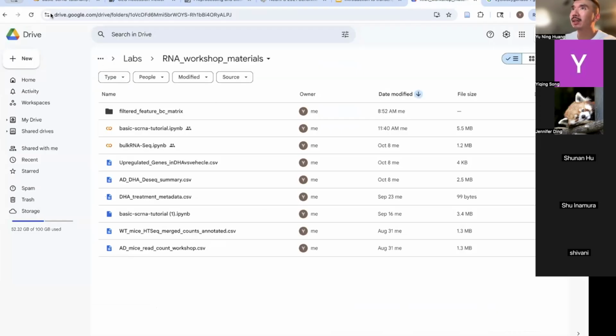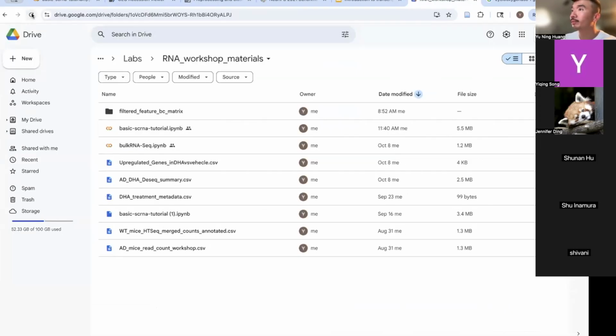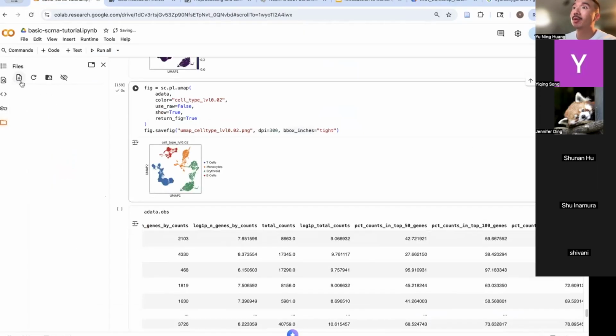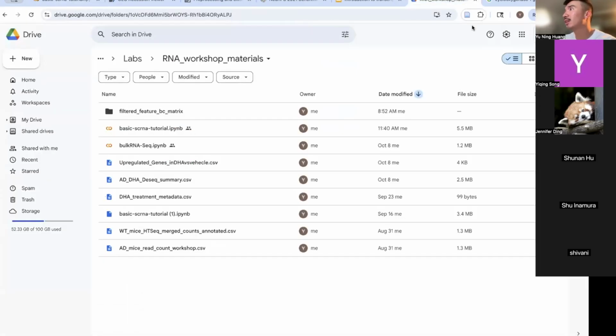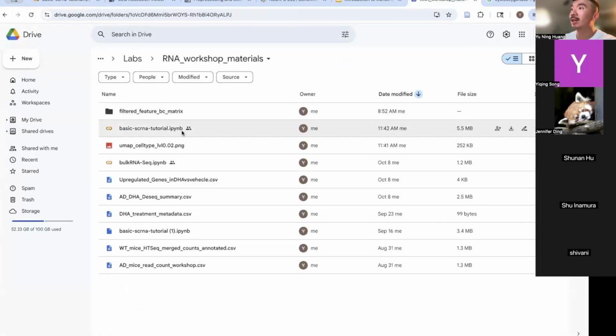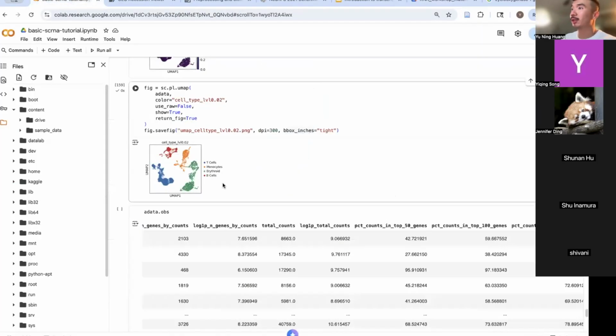And I think, did I link it here? Yeah, one thing to remember is if you didn't link your Google Colab, it will save it here using to download. But I think I did link it. Yeah, so now I just saved the figure here and then I will put this into my slides or discuss with Dr.